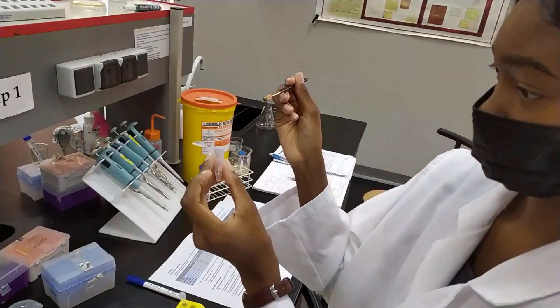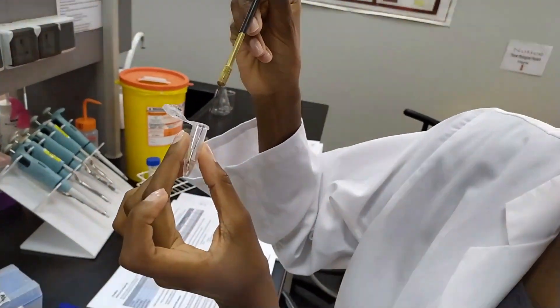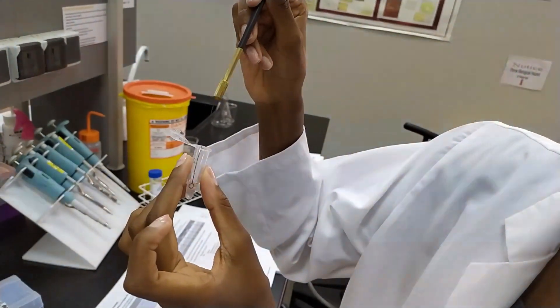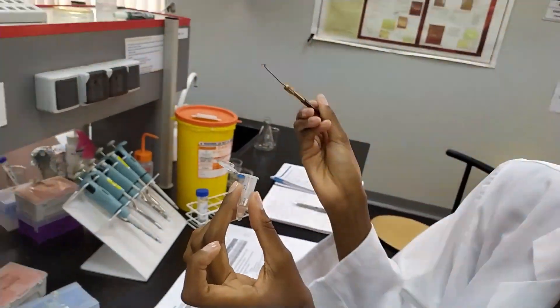Once you've picked your colony, you're going to put that into your epitube with TE. You don't have to worry about getting all of the cells into the TE — even a few cells will be more than enough. But feel free to get the whole colony in there if you want to.